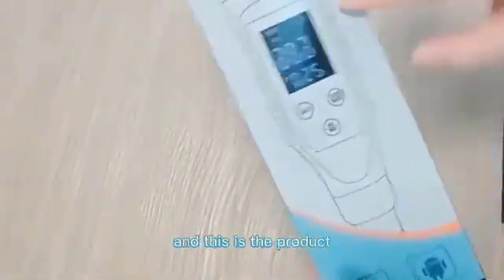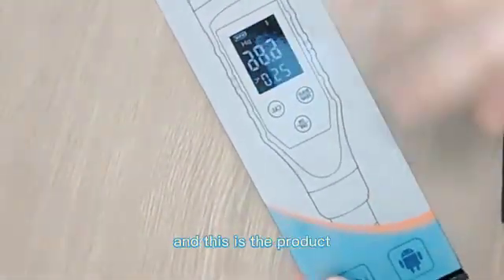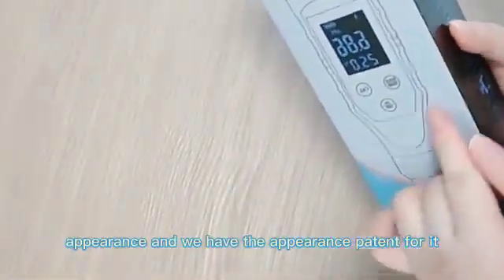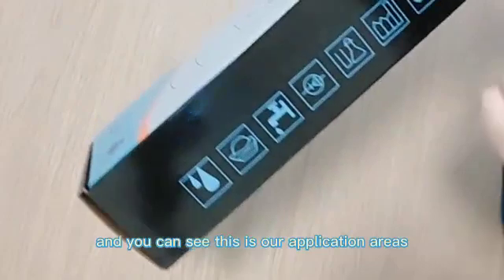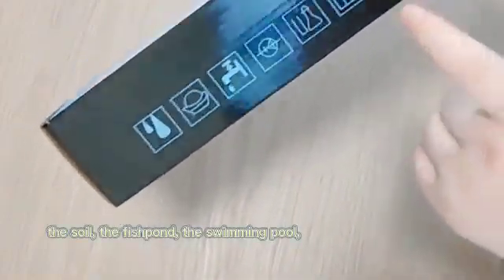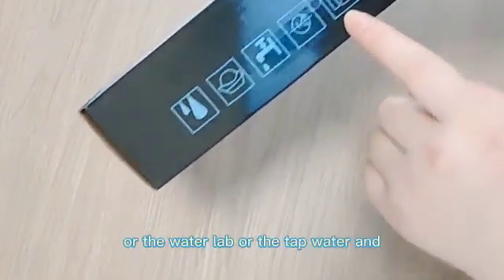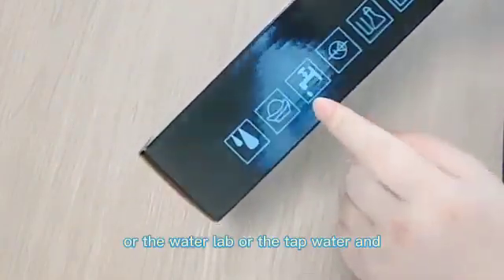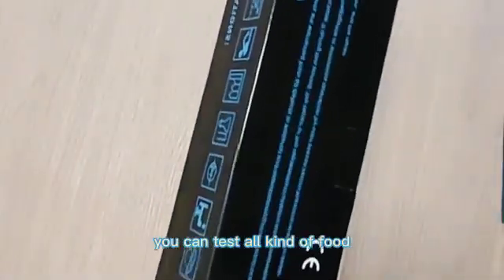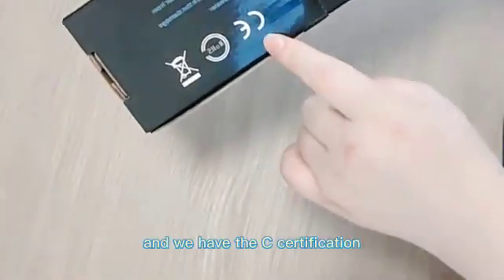Let's take a look at this packing. This is the product appearance and we have the appearance pattern for it. You can see the application areas are: soil, fish pond, swimming pool, water lab, tap water, egg, and food — you can test all kinds of food. We have CE certification and RoHS certification.